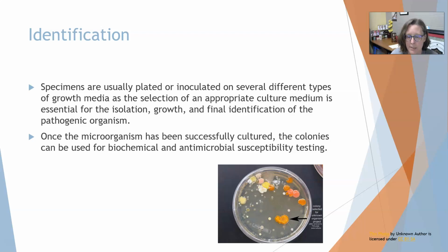Once there's growth on the plate, then we can look and isolate and identify what's growing on the plate. This one has a bunch of different types of bacteria because you can see a difference. They look different here. This is quite heavily either cross-contaminated or a very big mix of bacteria. This is more representative of what you would find from an environmental swab. But you could technically do tests on each different type of these colonies of bacteria and identify what each one of them is.